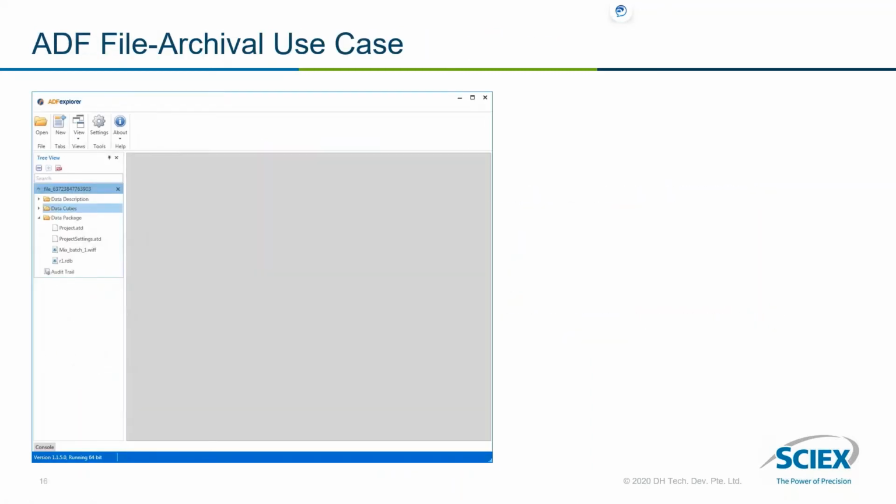So in the data package, we store all of the source vendor-specific files. We have the raw spectra file, the completed results set, and the audit trails. Within the results table and with file, all of the acquisition parameters and quantitation parameters are preserved.